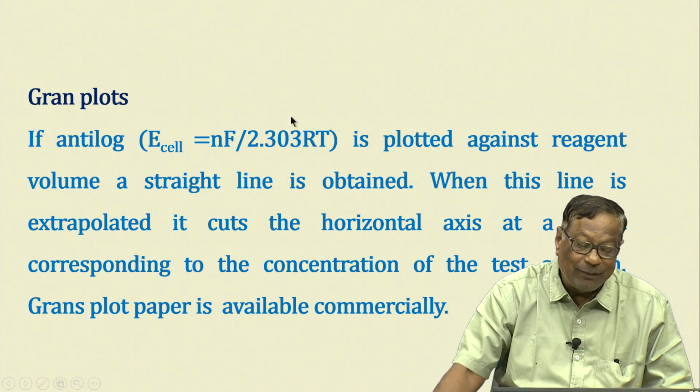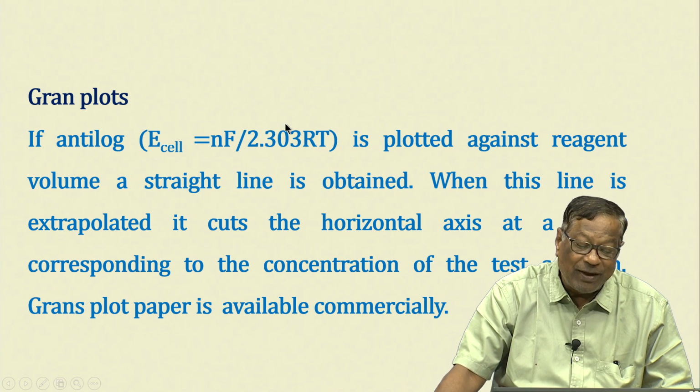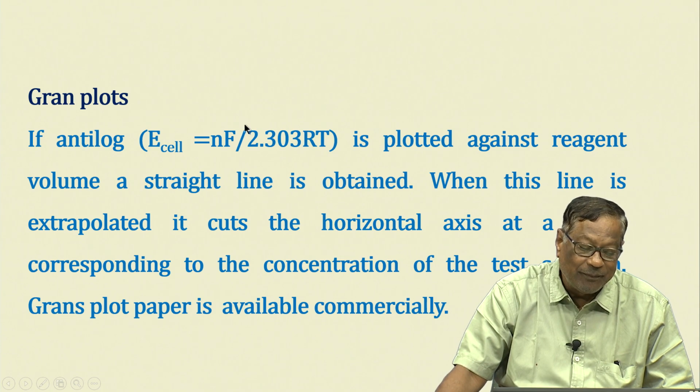Usually we say RT by nF, 2.303 RT by nF is the slope of the electrode in contact with a solution when we make the calibration curve.